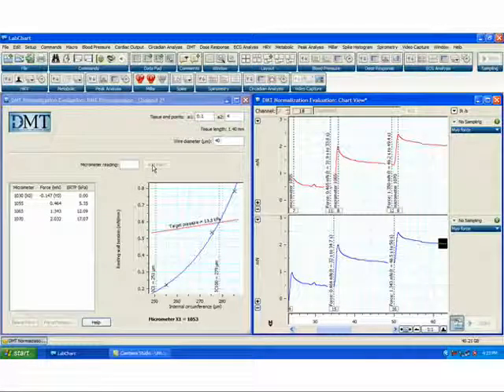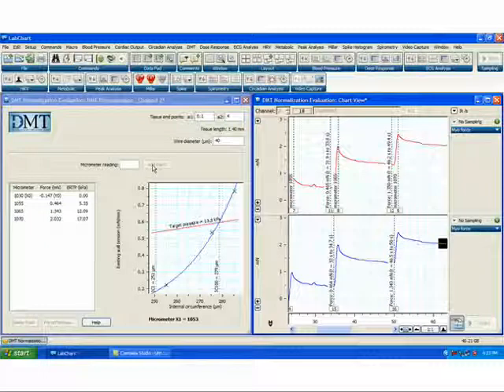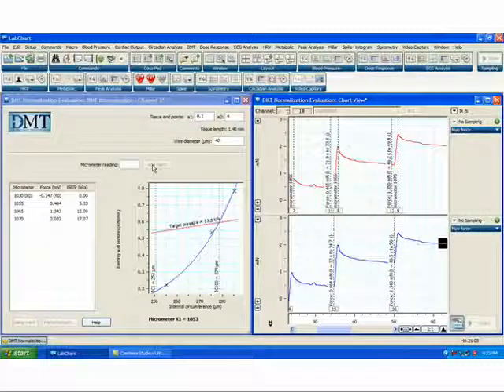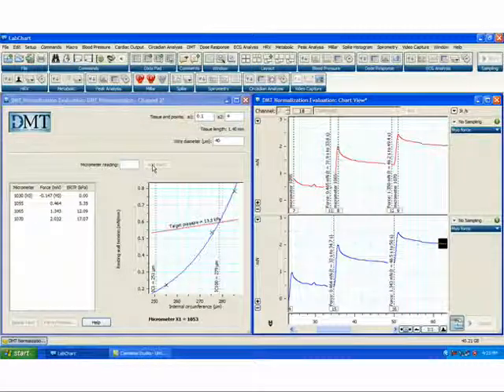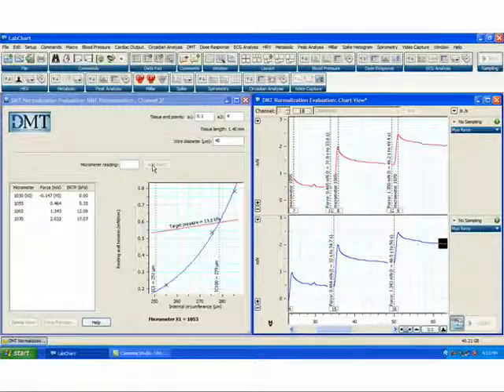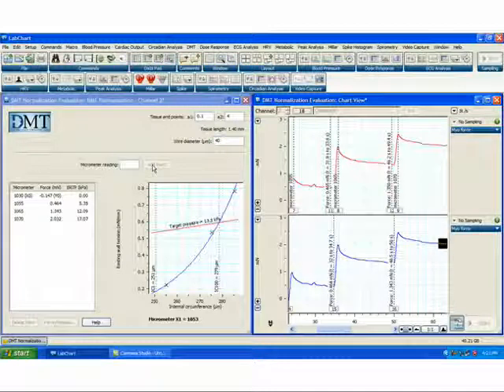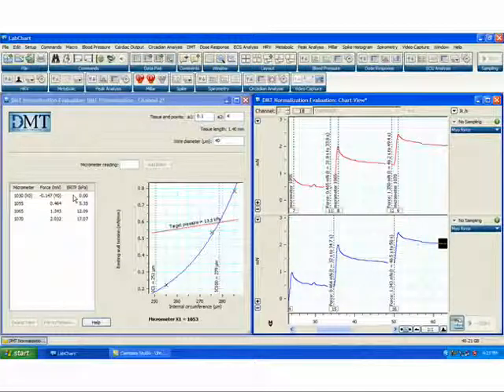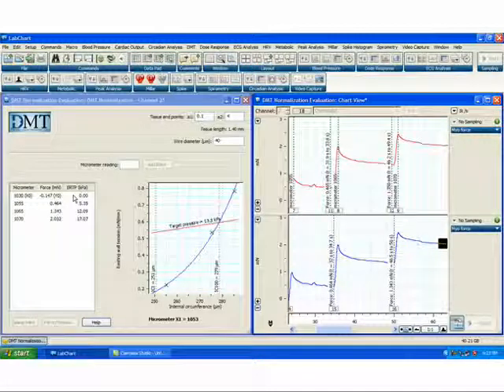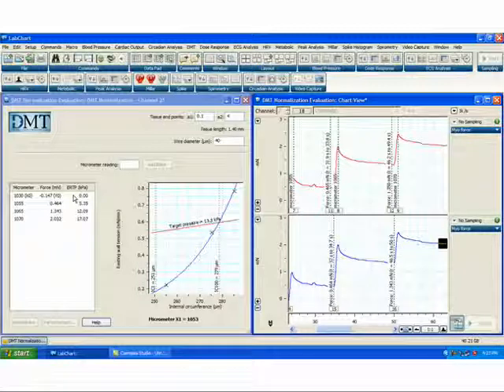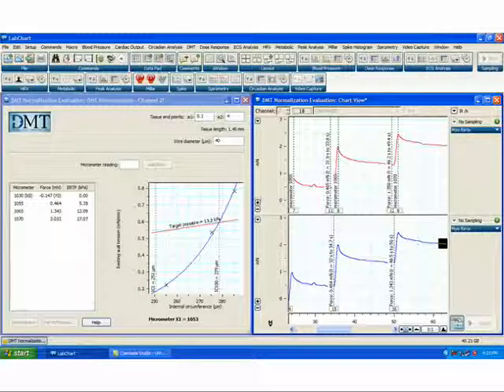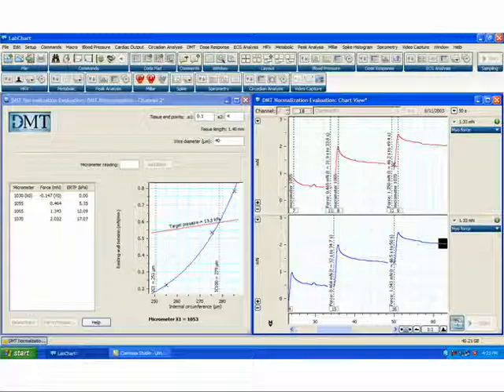After the delay time has elapsed, the DMT normalization module will take the mean of the data during the average time and automatically enter it into the DMT normalization module. At this point, you could choose to have it play a sound to remind you to come back to the bath and readjust the micrometer reading.